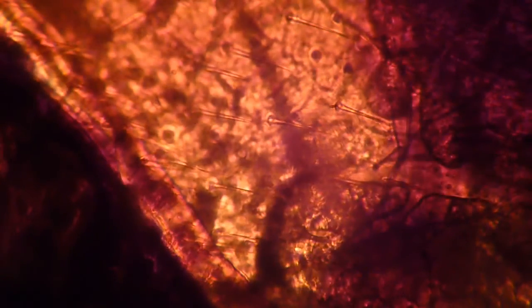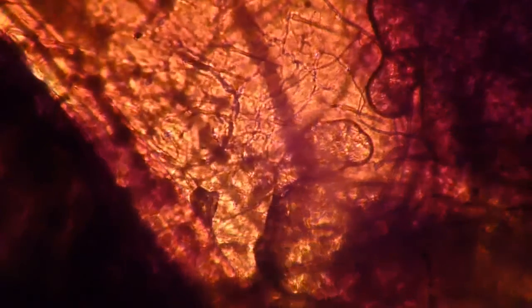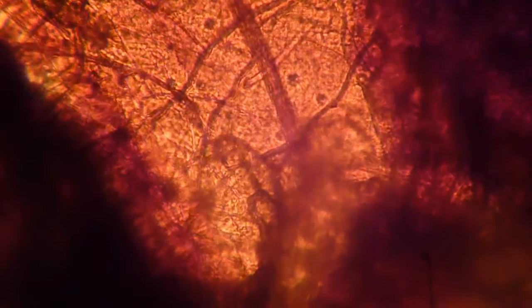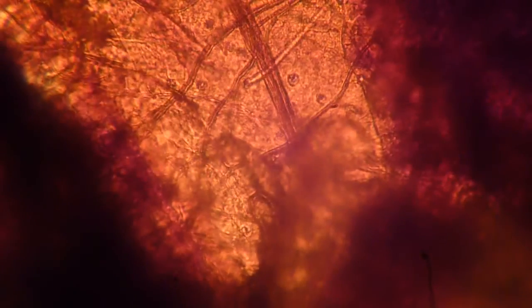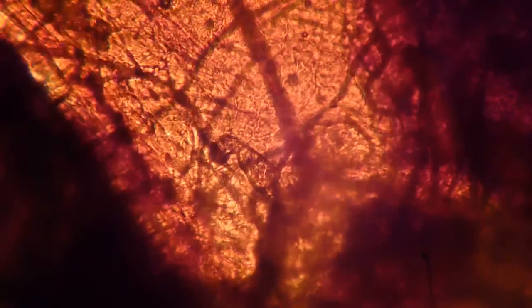I wonder what this is. You can see by using the fine focus knob you can actually focus through the body and see into the different depths of the body of the tick. It works quite well.